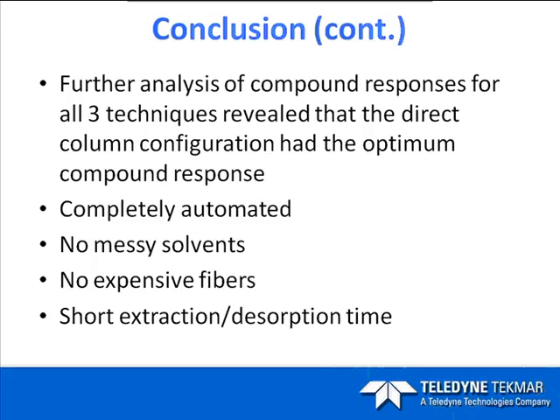Many of you are already using purge and trap in your laboratories, running 500 series methods, 600 series methods. The difference is you wouldn't be able to run those concurrently because you are using different traps. For 500 series, most of you are using either a number 9 trap or some type of Vocarb 3000, so you would have to swap the traps back and forth or have a separate purge and trap system completely dedicated.